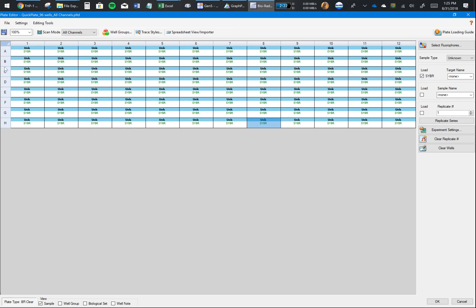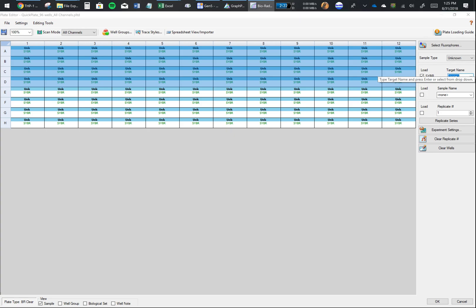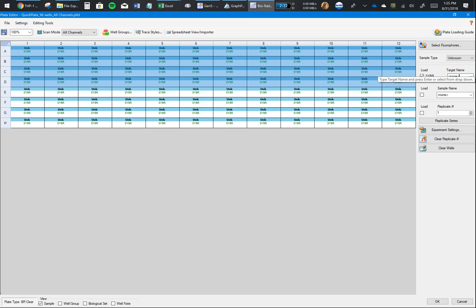The reason it's showing me all these other fluorophores is because I'm not connected to the instrument at this point. I'll manually select SYBR Green. Next thing after sample type, you want to tell the software which fluorophore you loaded - it's SYBR Green.